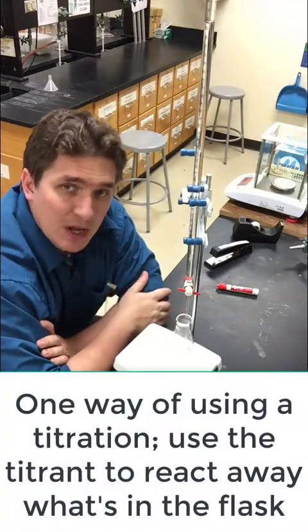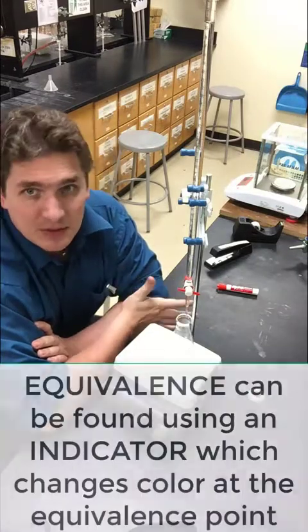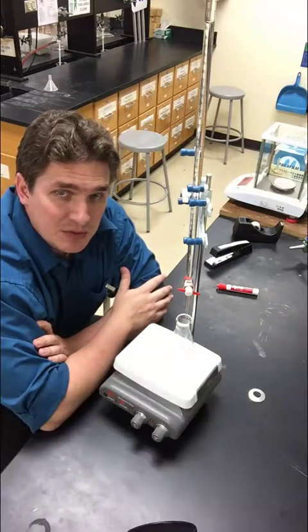Now how do you find equivalence? Well, typically you throw in an indicator. So for something like acetic acid, this will be phenolphthalein. Phenolphthalein turns bright pink at the pH range where we expect it to for acetic acid neutralization.